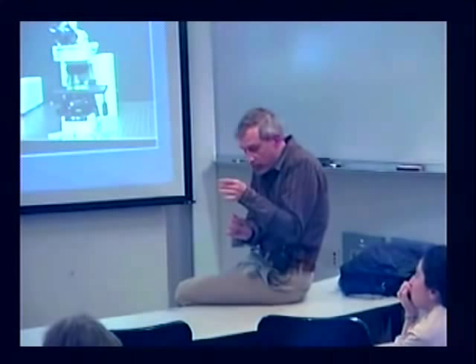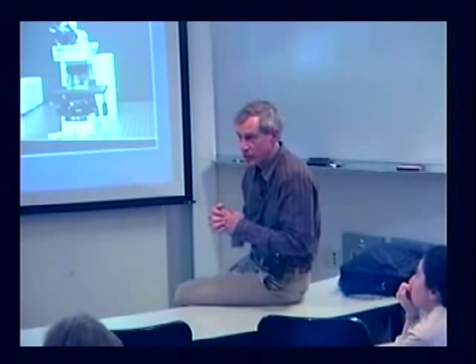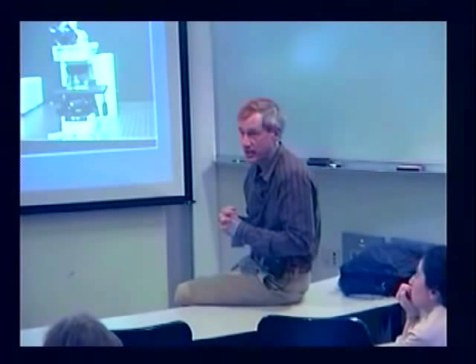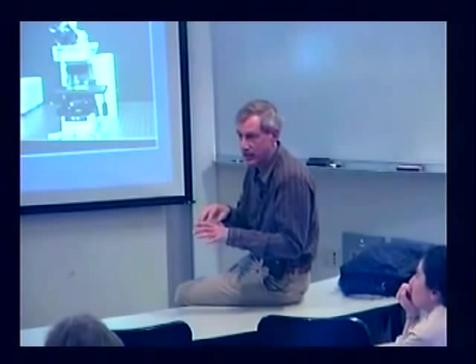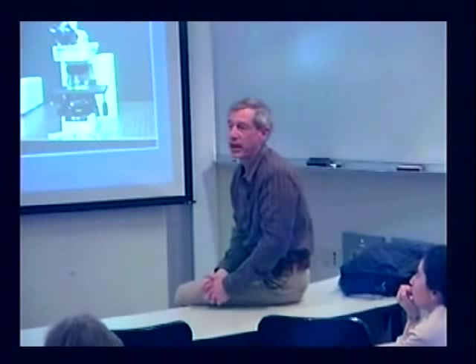If you move the pixels sideways by half of the pixel spacing, you might be able to do super resolution in angle. Beyond that, especially in the microscope, you're going to have to try to beat the diffraction limit. There's been some interesting work in microscopy on beating the diffraction limit using structured light, but not of this kind, that's sub-diffraction limit, and then doing interesting aliasing games in the Fourier domain, or by looking for some nonlinear fluorescence stuff. There are games one can play, and this doesn't preclude them, so one could do them in addition to this to try and increase the resolution.